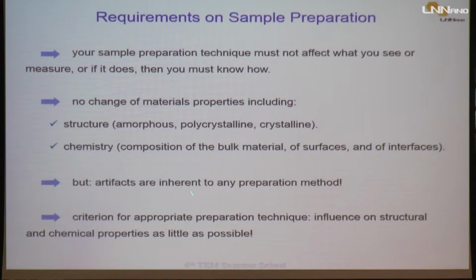And then the criterion for the appropriate technique is the smallest change, the smallest influence on the structural and chemical properties of your sample. This is very important. I mentioned yesterday the need for the researcher to know very deeply the properties of the sample before going to the microscope.